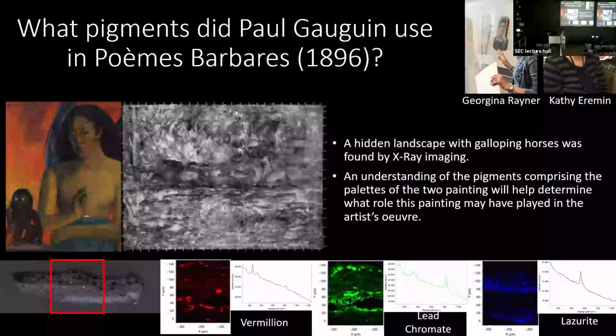with this different paint, this different Polynesian goddess, and they wanted to understand what the different paints were that he was using. So they will take cross sections of the paint, either with a scalpel or with a hypodermic needle, and then they brought the cross section and we did Raman maps and determined where the different paints were.